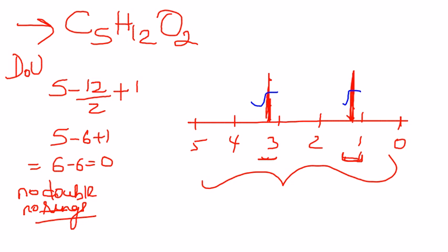So since there are only two chemical environments, we have to start placing them, and one of them is more deshielded. It could be next to another electronegative element, and the functionality there that I'm thinking about is an ether, because in your head you should be thinking, well, I know carbonyl, but carbonyl will be a double bond, and I'm not supposed to have a double bond, so it cannot be a carbonyl, it cannot be a carboxylic acid, it cannot be an ester, it cannot be any of those, it cannot be OH because there's no broad peak. So what remains? It's an ether that remains.